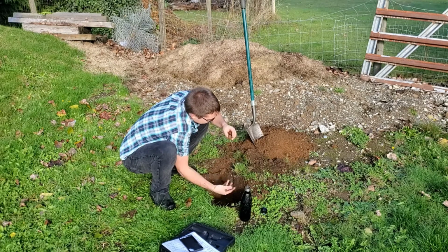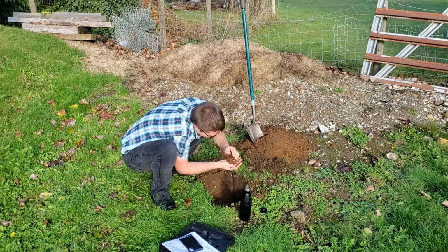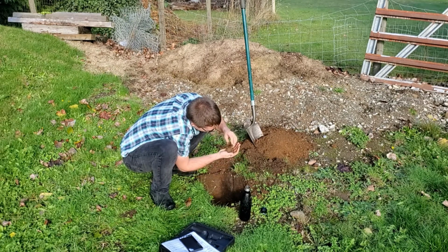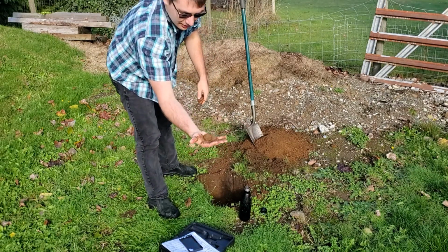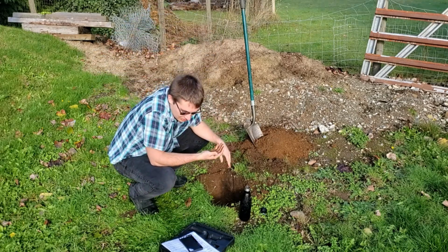So a ball, maybe a bit bigger than that. Let me grab some more. Sure. A ball about that big, 2.5 centimeters. So now we just follow the flow chart.